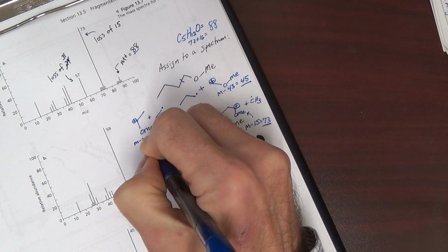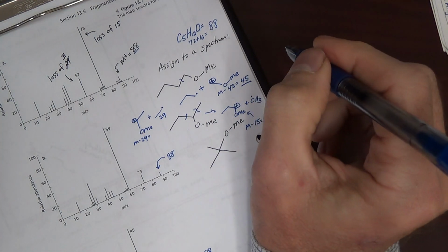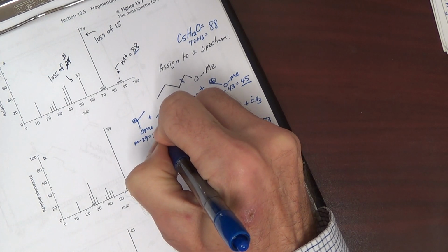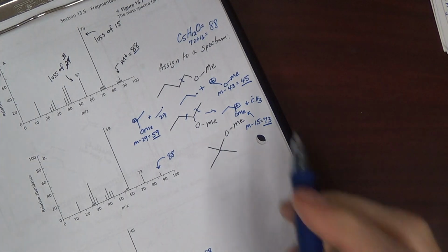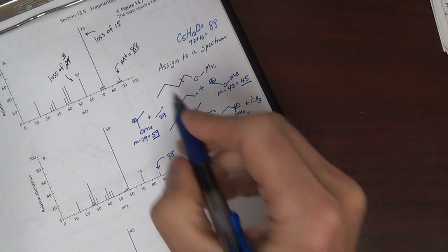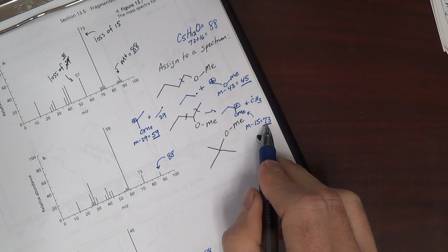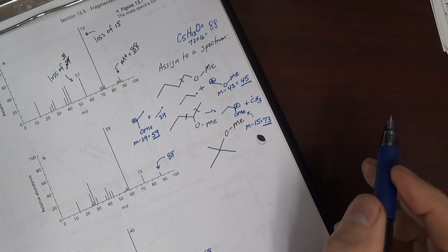So this is M minus 29. 88 minus 29 would be 58 plus 1, 59. Little crowded here, but for the second compound we are predicting a 59 and a 73. Where for the first compound we're just predicting 45.